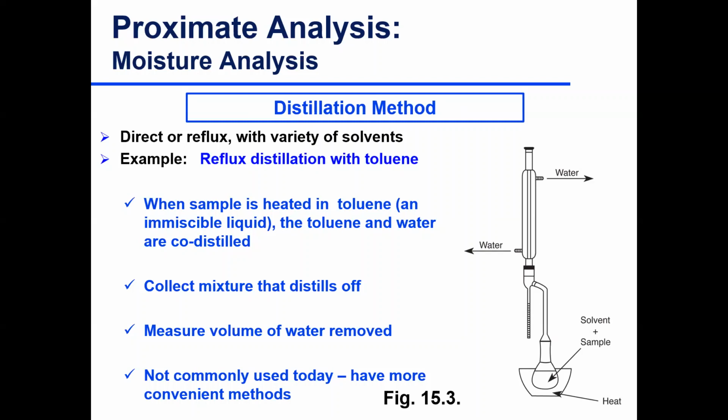And most people can run it. You put your sample down here. You mix your sample with a solvent. I don't know if I mentioned which solvent, toluene, for example. So it could be a powder, it could be anything. Put your toluene down here and you start heating the toluene. Toluene will carry some water with it.